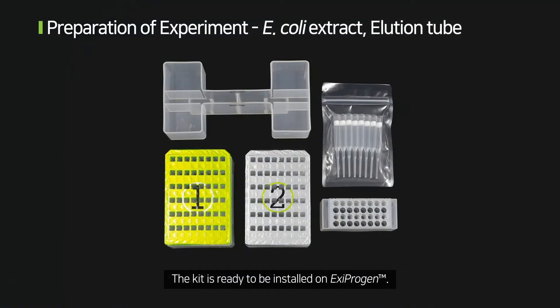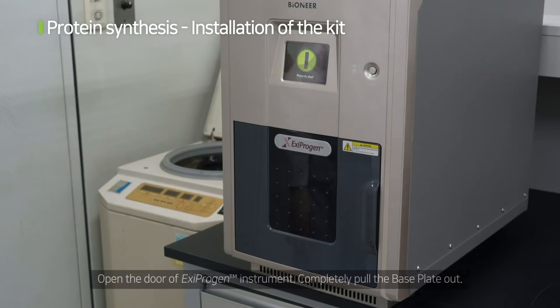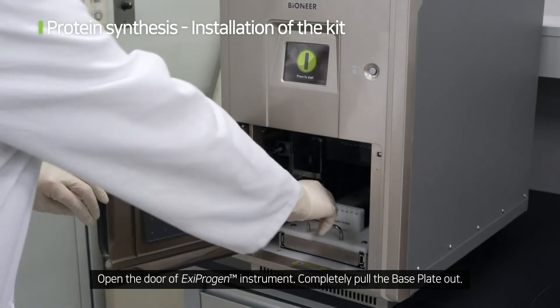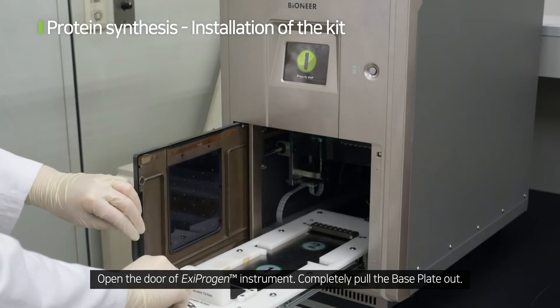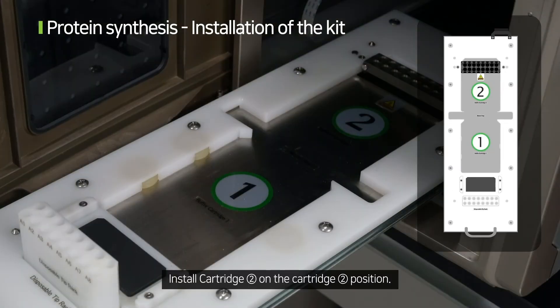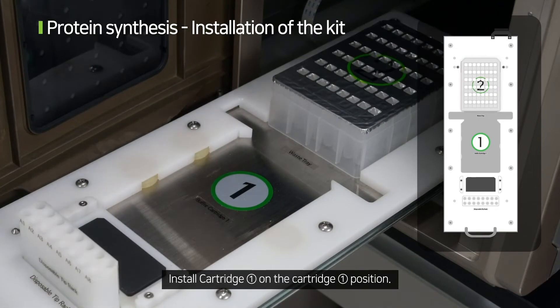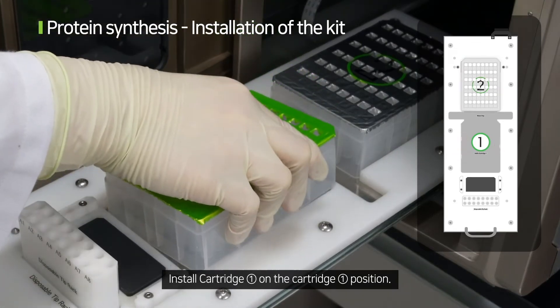The kit is ready to be installed on Xiprogen. Open the door of the Xiprogen instrument and completely pull the base plate out. Install cartridge 2 on the cartridge 2 position, then install cartridge 1 on the cartridge 1 position.